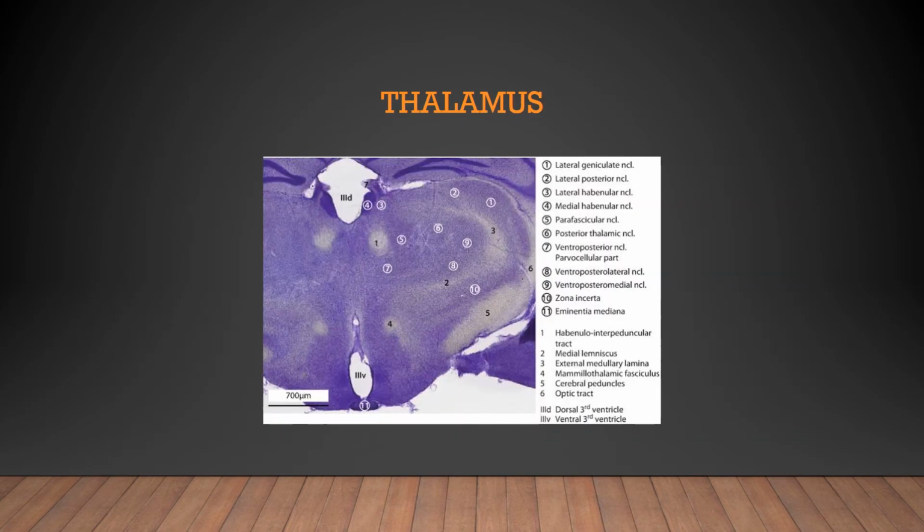So this next slide is of the thalamus. It's not that common in terms of examination, but if you wish to take a moment to study it, you may do so.